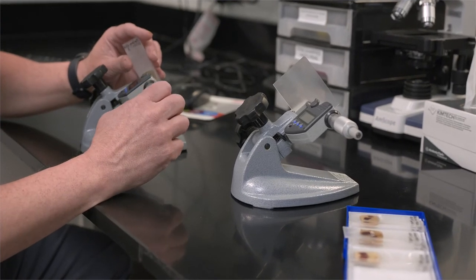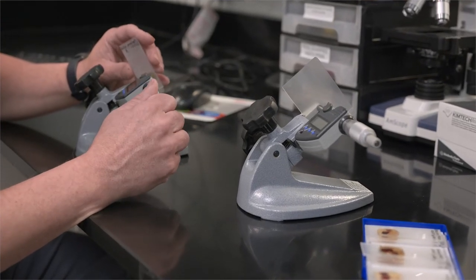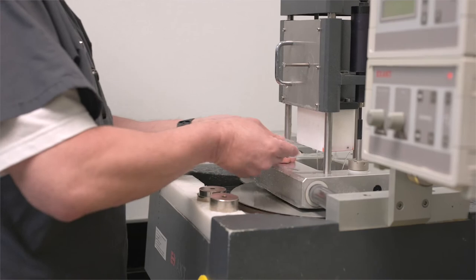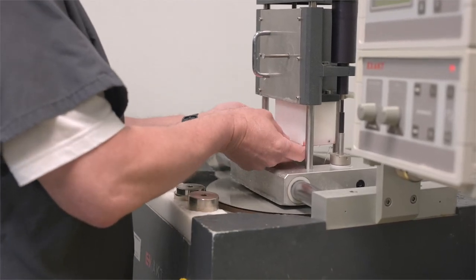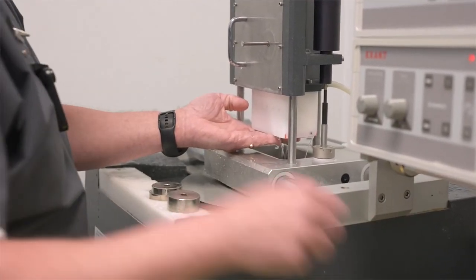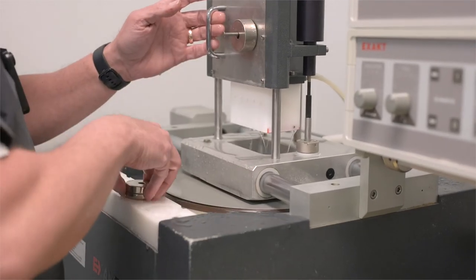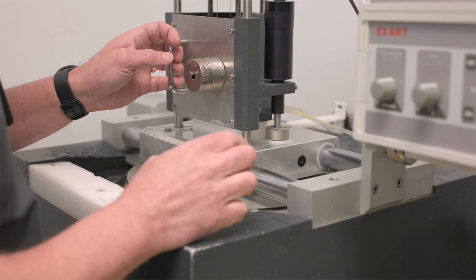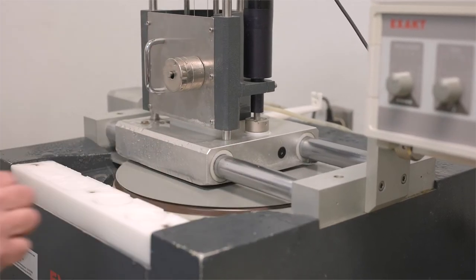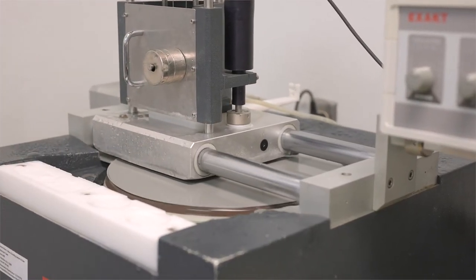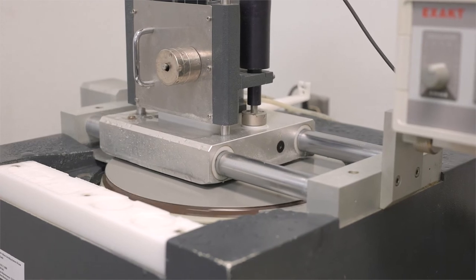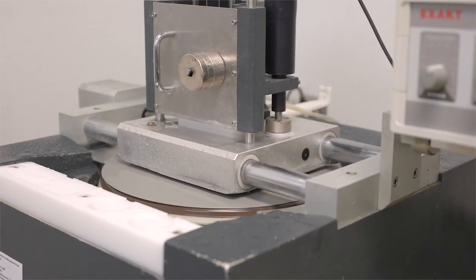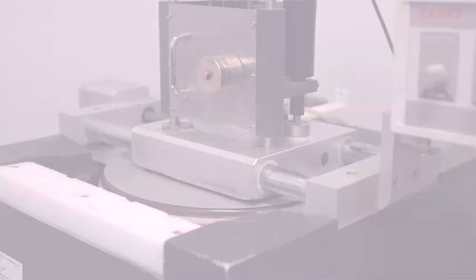Multiple measurements are taken throughout the process using a micrometer along with math calculations in order to determine the thickness of the final section or sample. The final slide is ground to the desired final thickness using various grits of grinding paper. Once the desired thickness of approximately 70 microns or less is achieved, the scratches are removed using polishing paper and the slide is ready for staining.